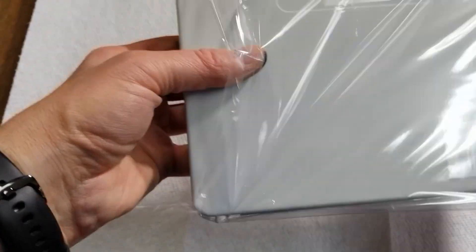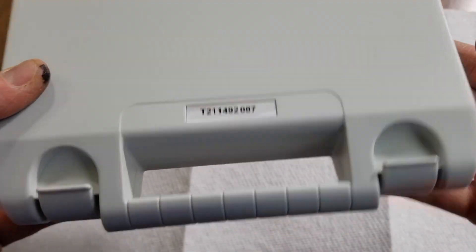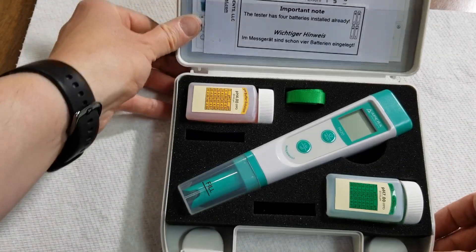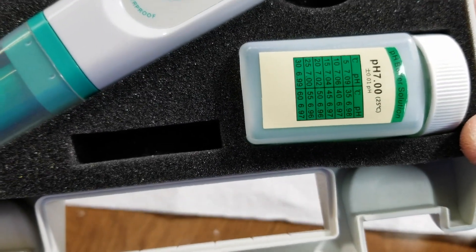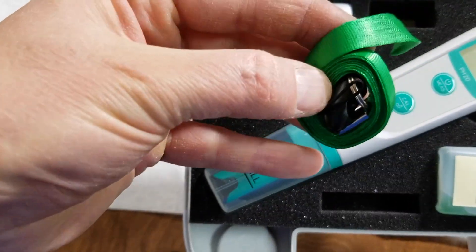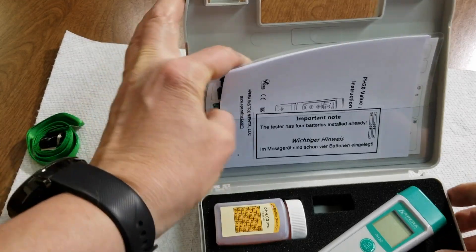I'll go ahead and get a closer look at this and we'll unveil it, take a look at it. So I like how it comes in the little plastic case. We've got the tester, the calibration solutions — the 7 and the 4 — a little lanyard, and a little pouch here for your documentation.